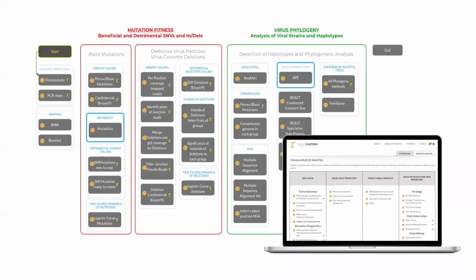So in our upcoming sessions, we're going to be leveraging the server.t-bio.info platform. And we're going to be running big data sets and then comparing how the various sequences differ at the genomic level. And we're going to be studying mutational fitness as well as virus phylogeny. So I see that Mohit has posted the link in the server, and I encourage you to take some time between now and our next session to go on the server and utilize that resource.